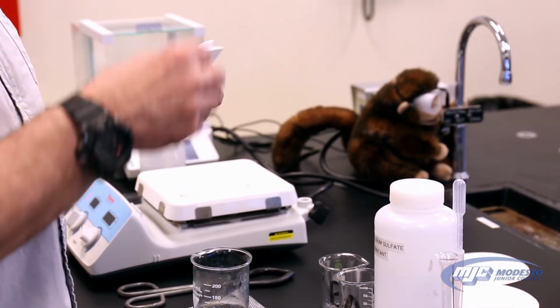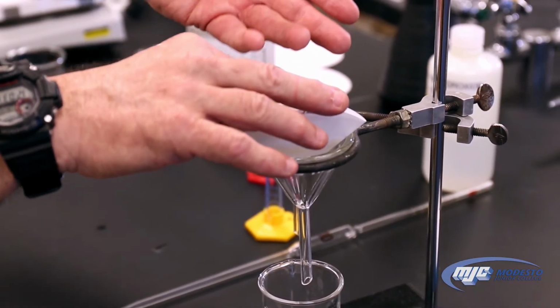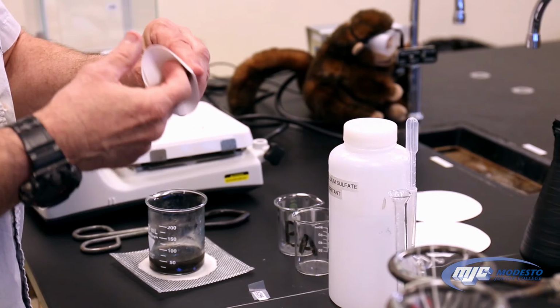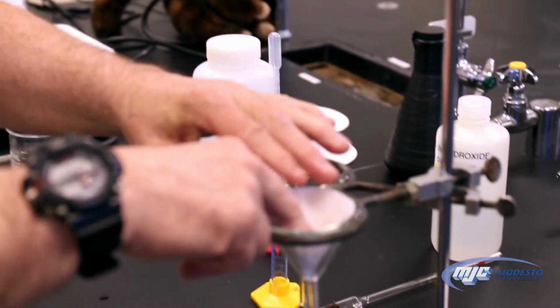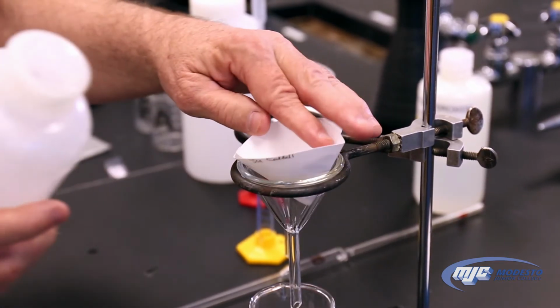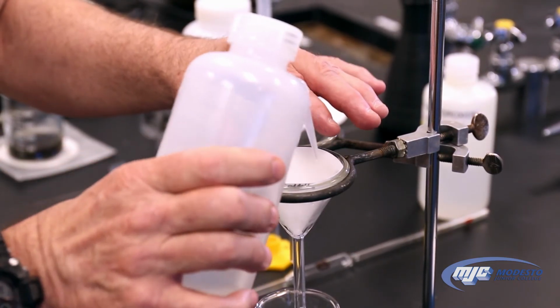Then we open it. Now, watch out. I've seen people do this. You don't want to open it this way. We're going to place it in the funnel. If you open it this way, it's not sealed. Your stuff's just going to go right through. It won't filter anything pretty much. So we open up one side or the other, like this, so that it's solid inside, forms a cone, place this in the glass funnel. That's going to pop up like that, so what we do is we take some deionized water and we just get it wet. That way it'll stick to the sides, and that'll prevent any of our copper two oxide from being lost and going through into the beaker.